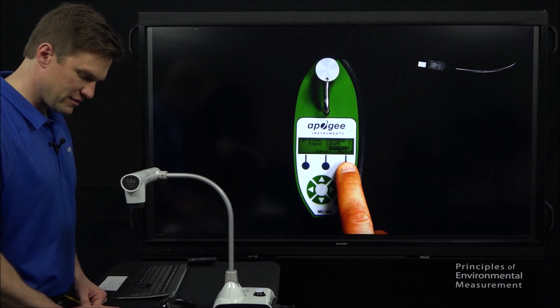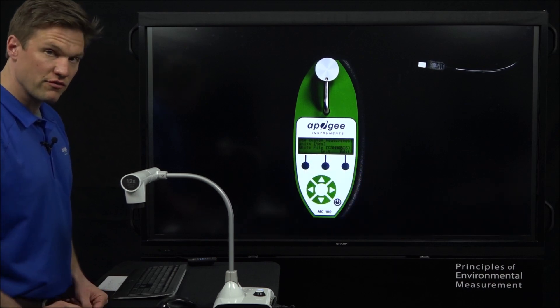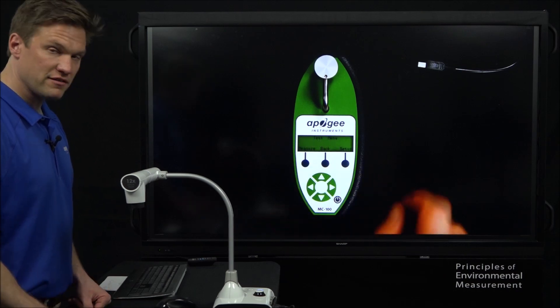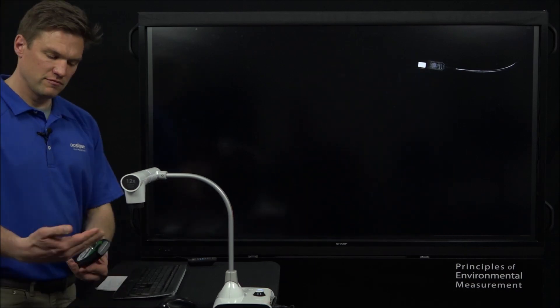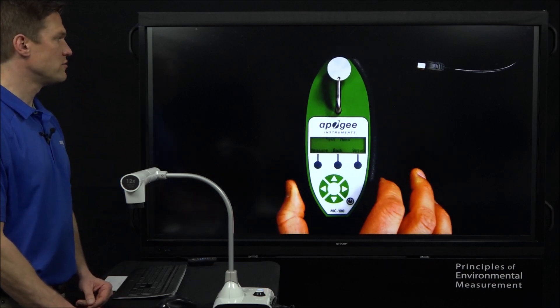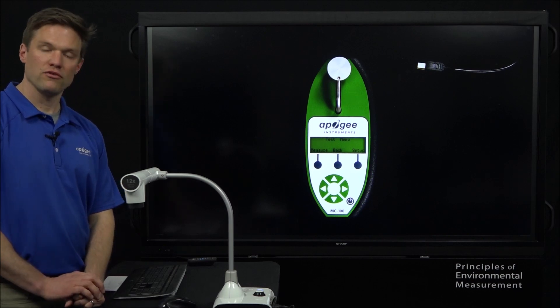So, excellent. Let's hit accept. Now we have cannabis coefficients selected. We can exit out of this screen and we're ready to take measurements. You can just stick the leaf in there, depress the arm and you'll be taking accurate absolute chlorophyll concentration measurements of cannabis. Or if you selected grape, you can get them for grape.